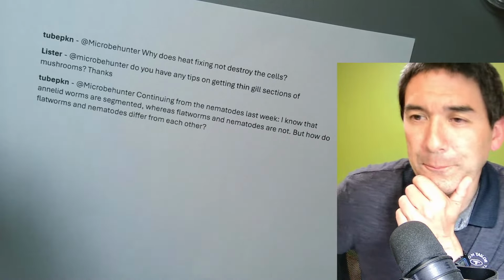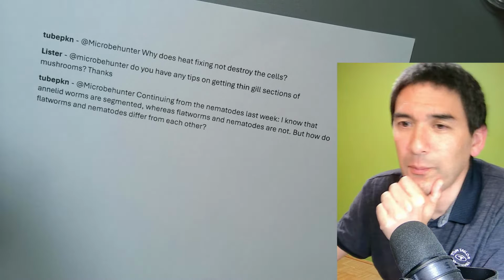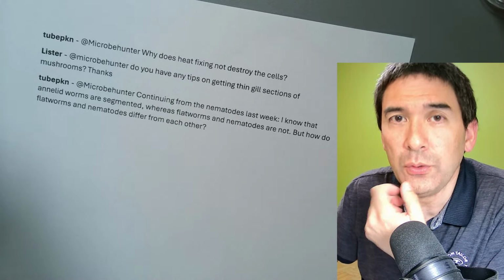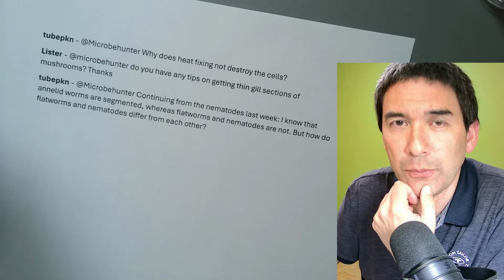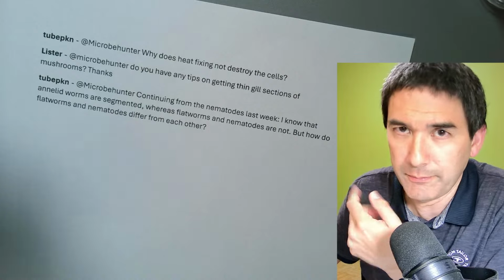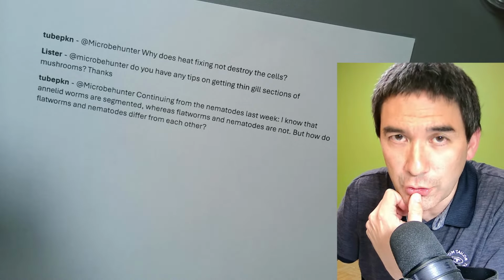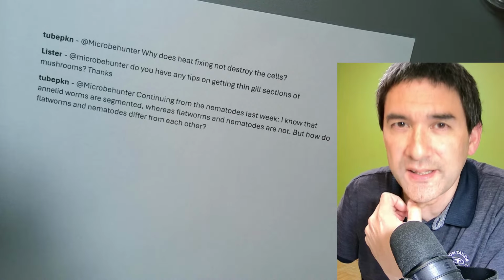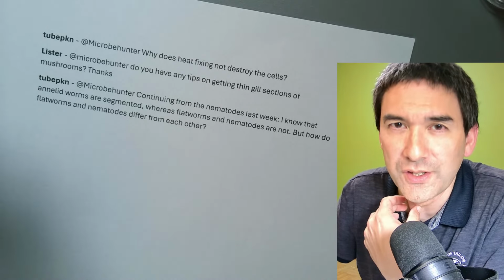Let's put it this way. We've got all of the equipment that we need, but if you read some of the original publications from even the 19th century, I'm quite surprised how advanced they were in some of the observations.